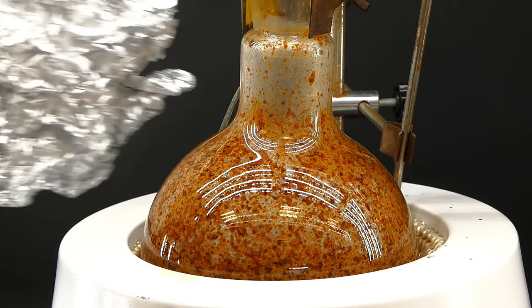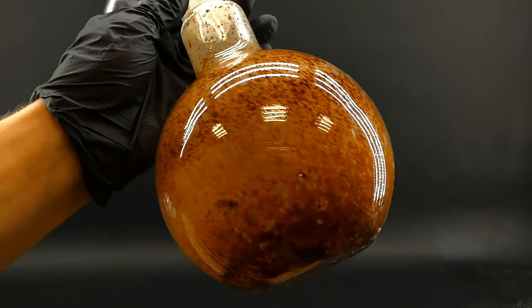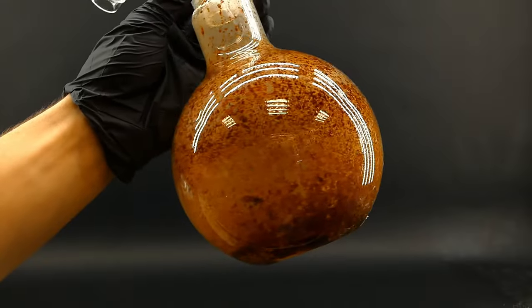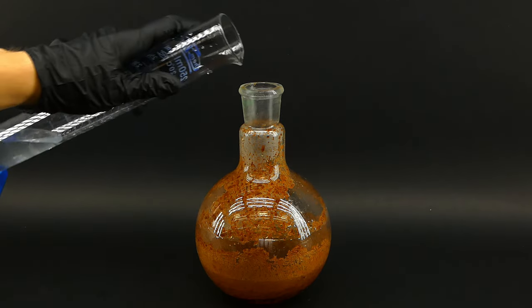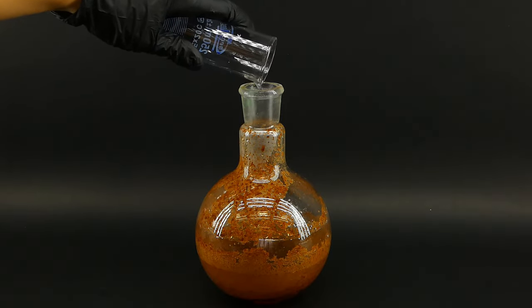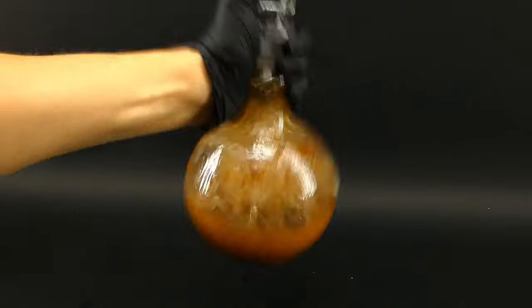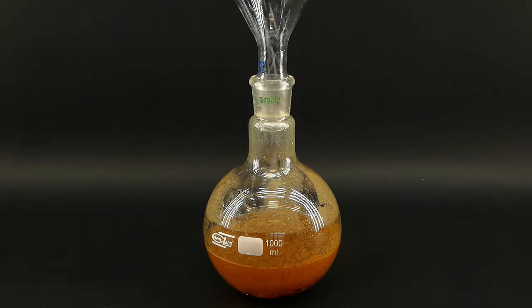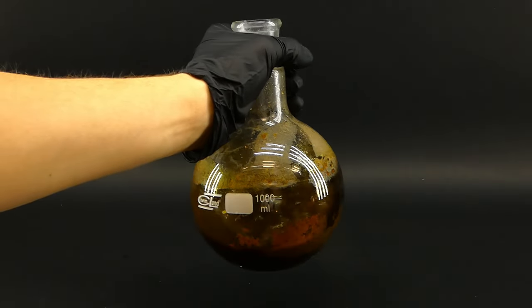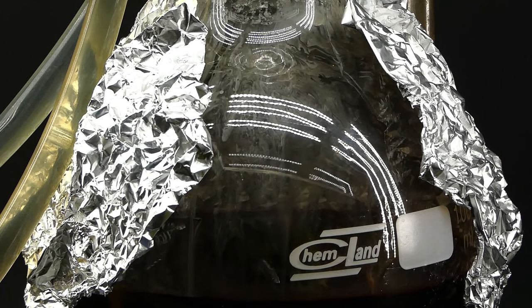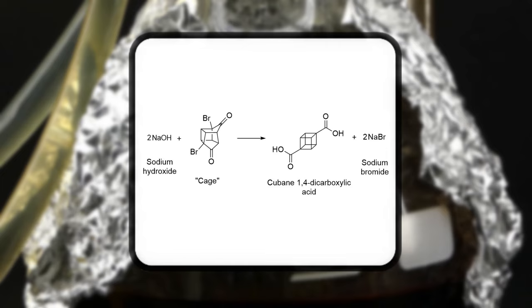When the distillation finished, I was left with a brown tar that should contain my product. I could theoretically try to isolate it, but I figured there was no point since I would definitely lose a lot, so I proceeded to the next reaction in which I will finally be forming my cubane. I poured 330 ml of distilled water into the flask containing my product — it didn't dissolve at first but after shaking I got it loose — and then to initiate the reaction I added 85 grams of sodium hydroxide. Everything immediately turned black and got very hot, and to drive the reaction forward I set this thing up for reflux. The reaction going on here is known as a pseudo-Favorskii rearrangement: it strips off the last bromines from the molecule and extends one carbon atom forward, forming a carboxylic acid and making the ring smaller, which when repeated on both sides forms the 1,4-cubane dicarboxylic acid.